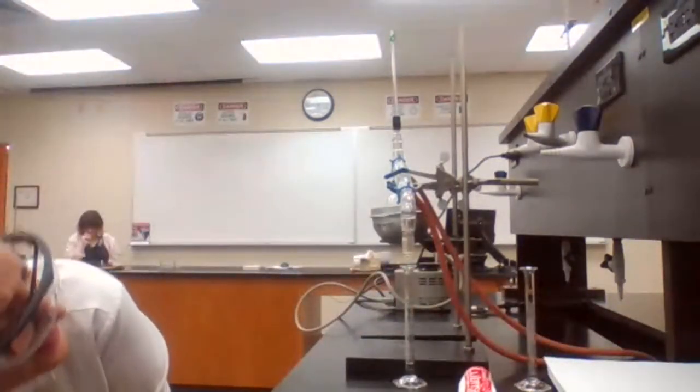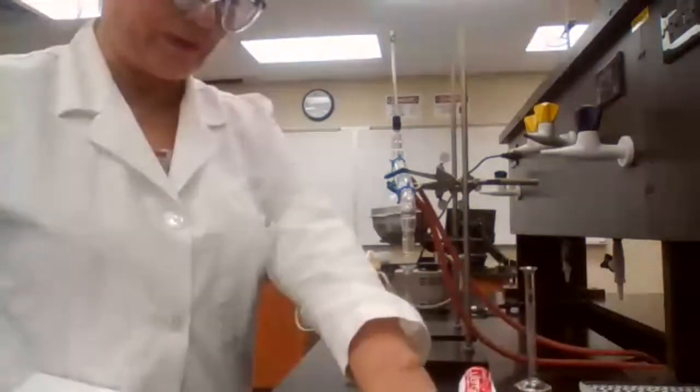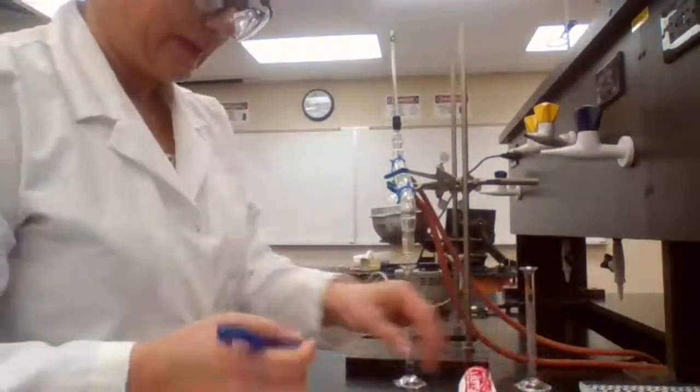And we are still waiting for the 2 milliliters, 2 more drops.